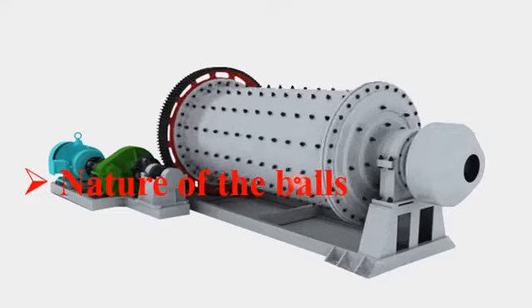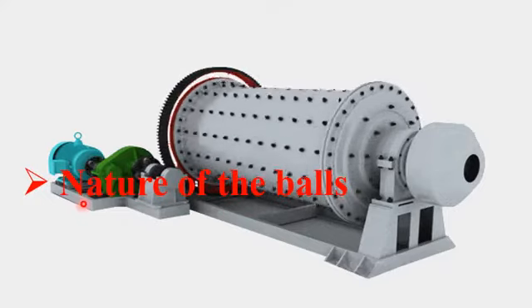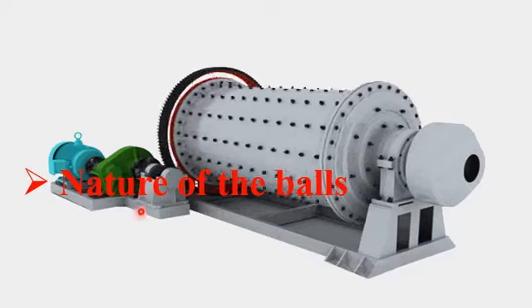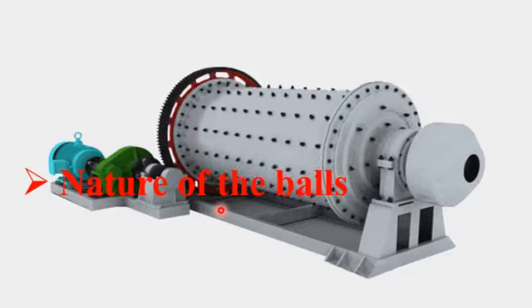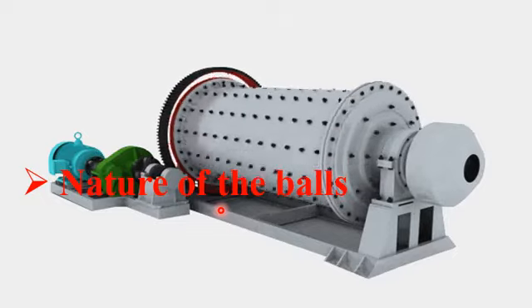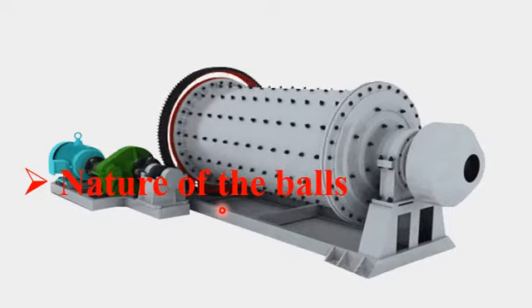Another key physical parameter used in the ball milling apparatus is the nature of the ball. Different types of balls are used in ball milling apparatus. These types may include balls made of steel, balls based on ceramics, and also balls based on rubber materials.